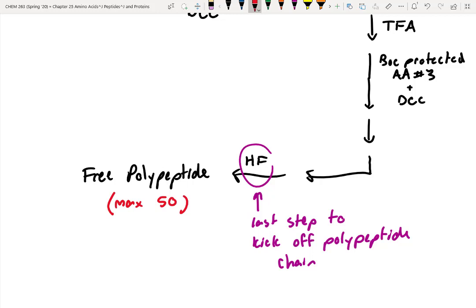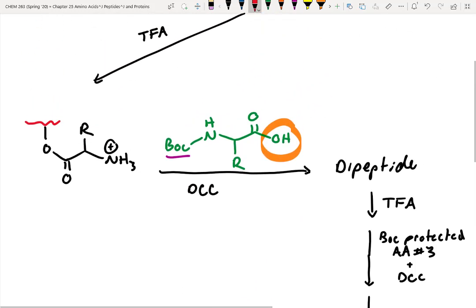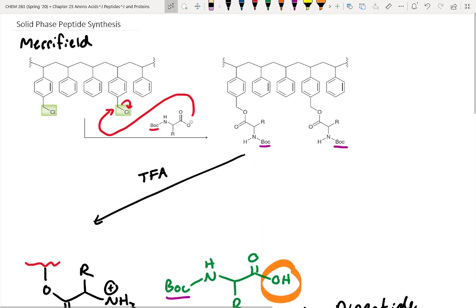In addition, they're learning how to fold these polypeptides into essentially proteins by using additional chemistry. So even though this is a method that was pioneered in the 1970s, really it's still continuing to grow and expand, especially as we're learning more about these protein-based drugs and polypeptide-based drugs.